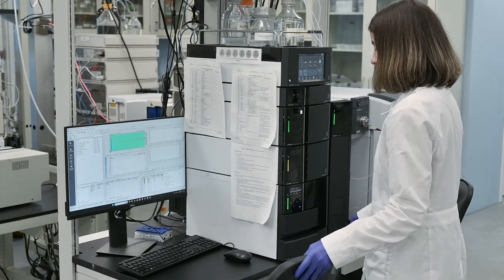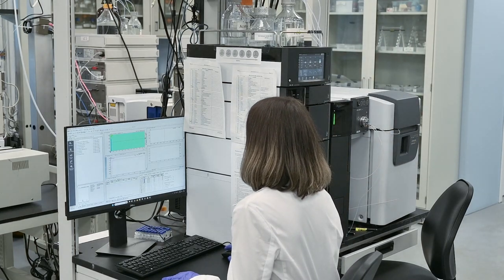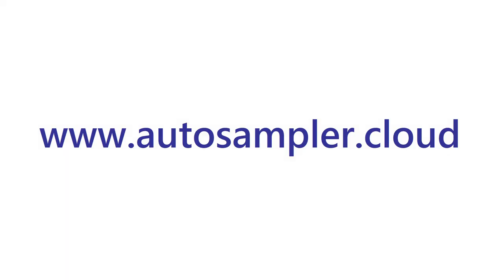Industry standard vial and trace systems are compatible with many analytical devices. Make sampling simpler with Samplify.